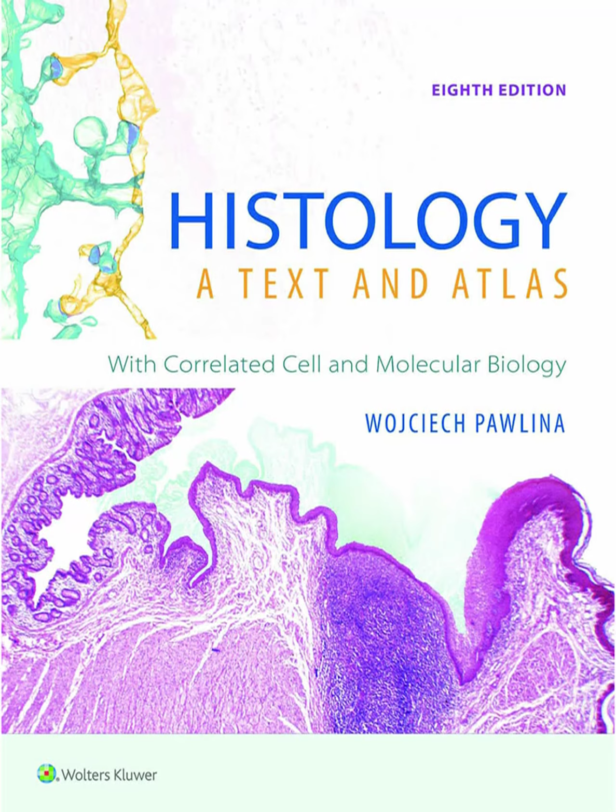Certain basic dyes, like toluidine blue, which is normally blue, actually change color when they bind to certain specific molecules called polyanions, things with lots of negative charges packed together. They change color. How? The dye molecules essentially stack up or aggregate when they bind to these polyanions, and this aggregation shifts the color they absorb and emit. So the blue dye might turn red or purple.